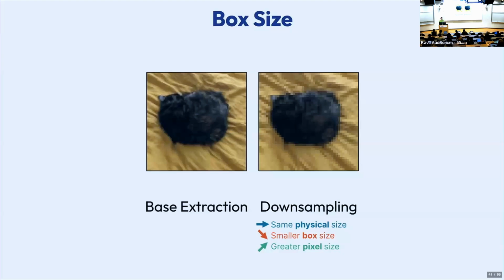Okay? I think that little band of fur is cute, and so I want to be able to see it. But the nice thing is I can extract my images at the downsampled size, do all of my particle cleanup, make sure I've only got good images of my cat, and then go back and extract at the full size so that we have the good pixel that lets us see that high resolution feature on her cute little ear, right?